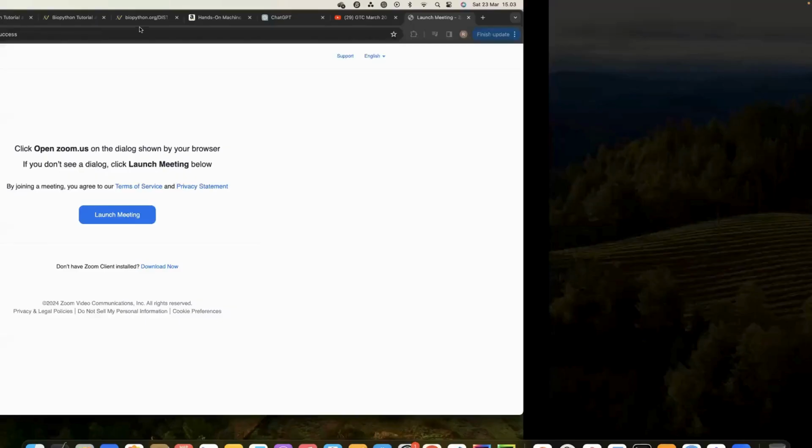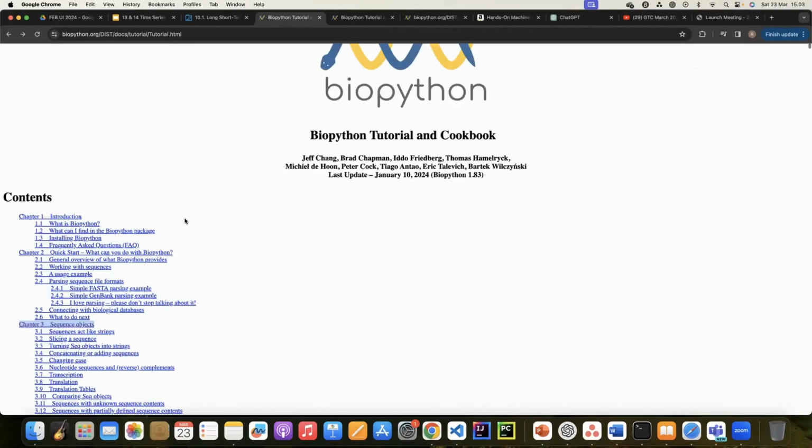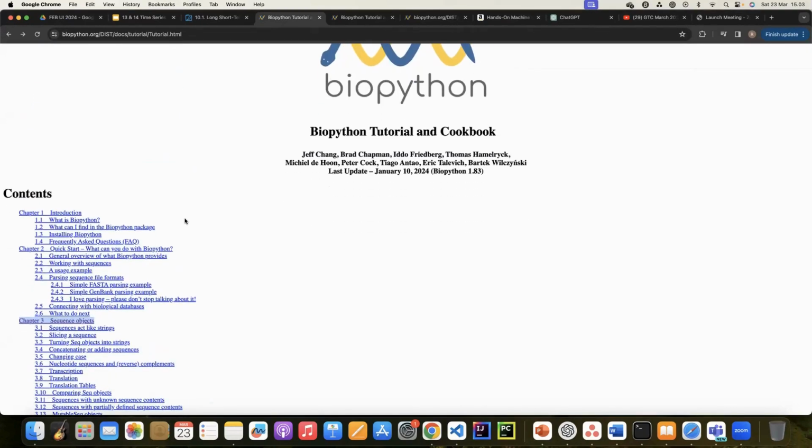So why do we do that? Because some frameworks provide best practices and predefined workflows, and you can reuse and reproduce instead of redoing from scratch. We want to make sure that you can reproduce as many previous works as possible, so you don't have to reinvent the wheel.